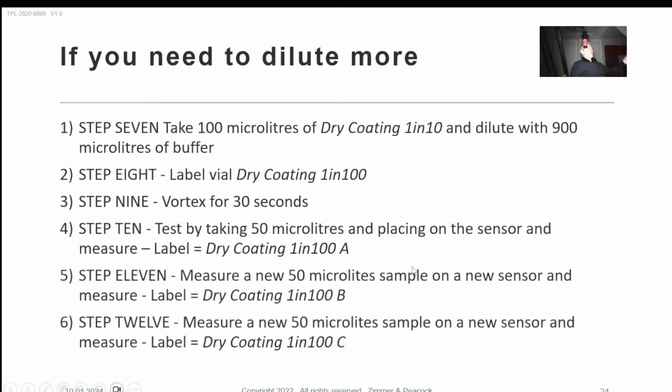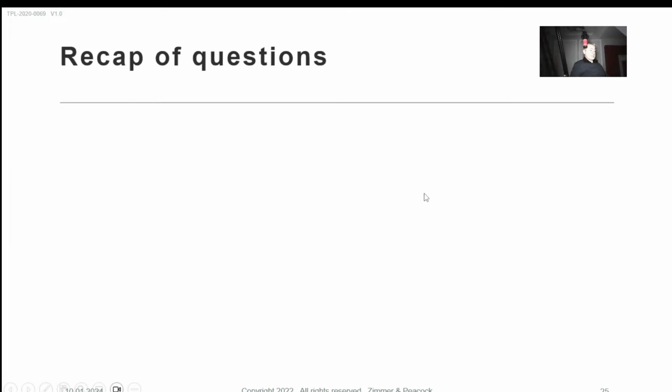Make sure it's a fresh cartridge with a fresh 50 microliters for each particular test, just trying to get an understanding of the true concentration. This is because within HPLC, they just do one measurement. Really, they need to do a couple more measurements and actually do the average and standard deviation, but they don't because it's too expensive to do.